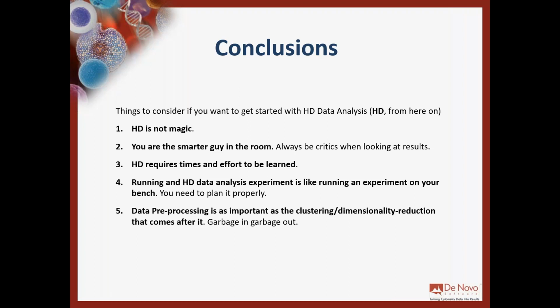Take your time to learn, to read the original paper of the algorithms, read the manual of FCS Express, re-watch the webinars that we have. Really, I think it's good to say that you need to enter a state of mind in which a high-dimensional data analysis experiment is like an experiment that you run on the bench. So you need to plan it, you need to spend some time to create your pipeline. It's like creating a new protocol from scratch. And always remember, data preprocessing is really important. So I think we have done.